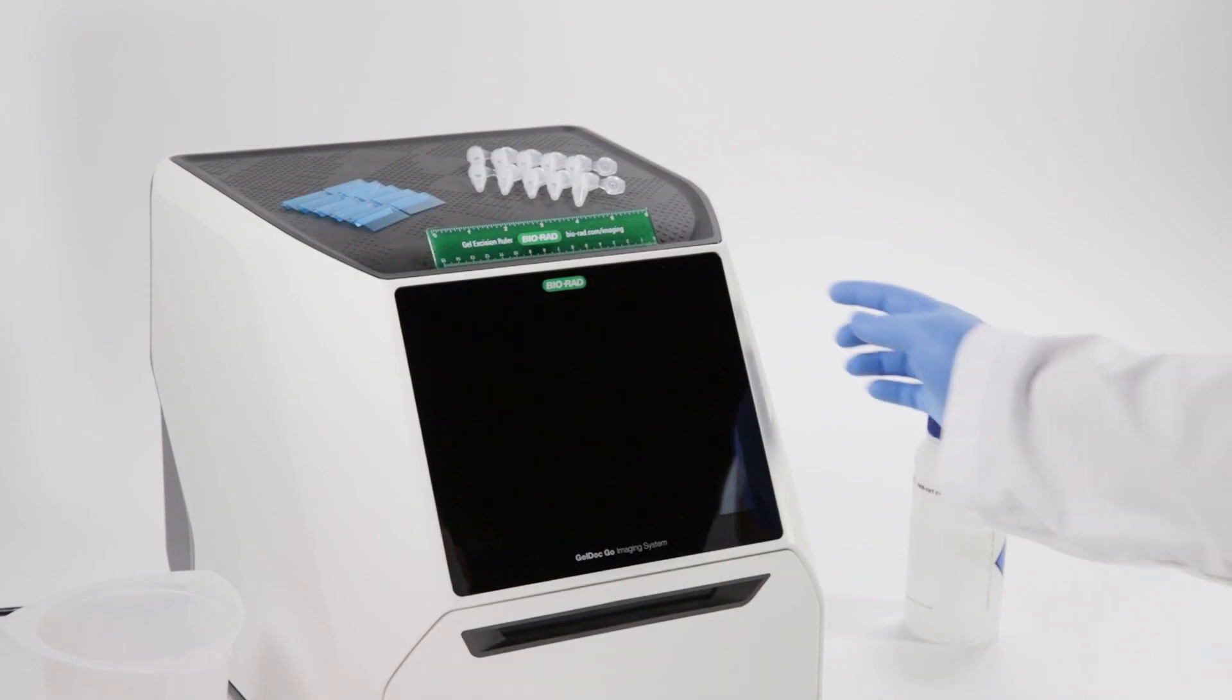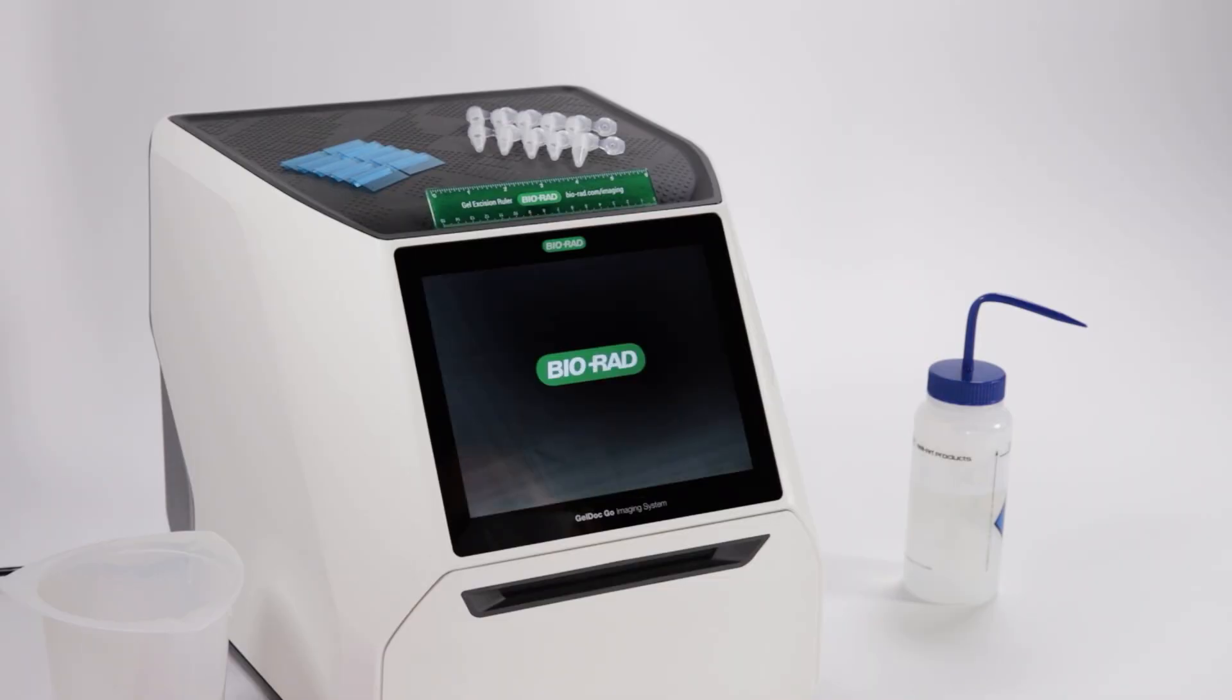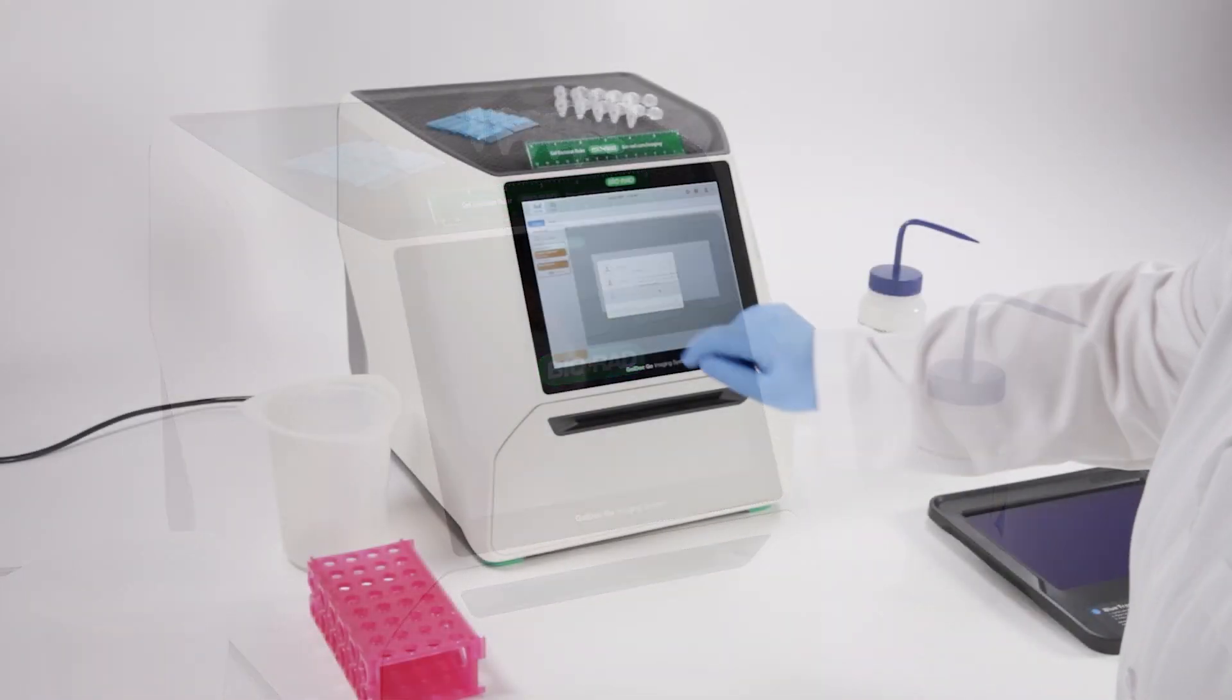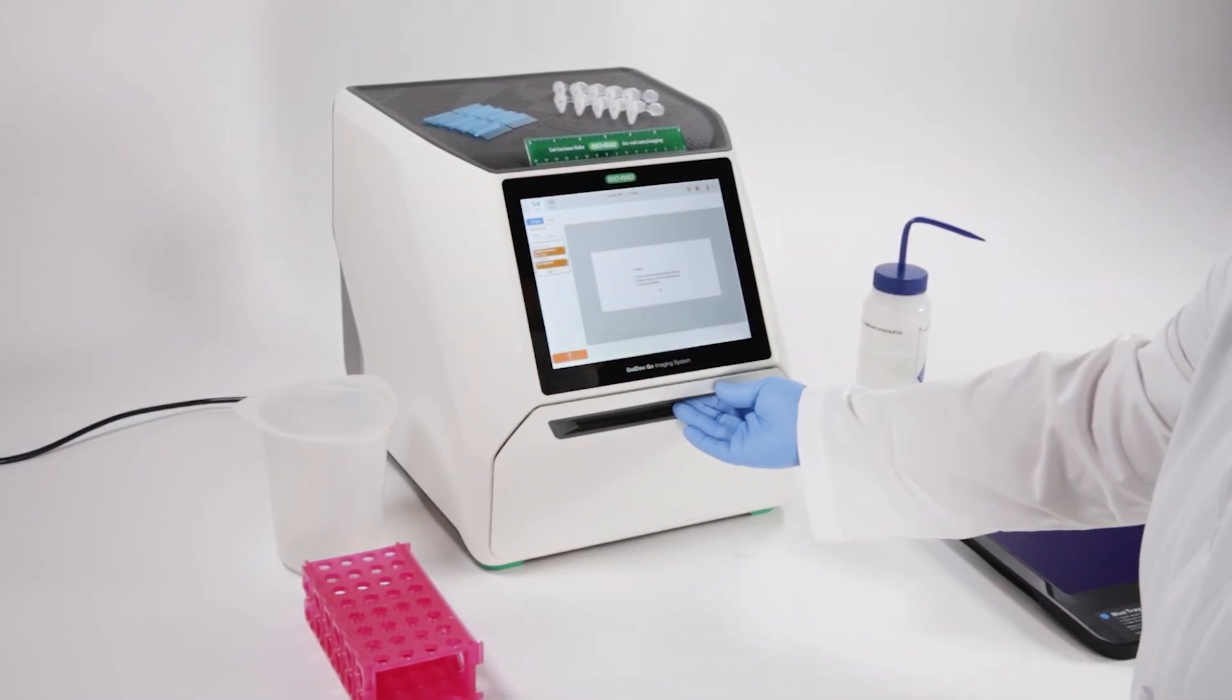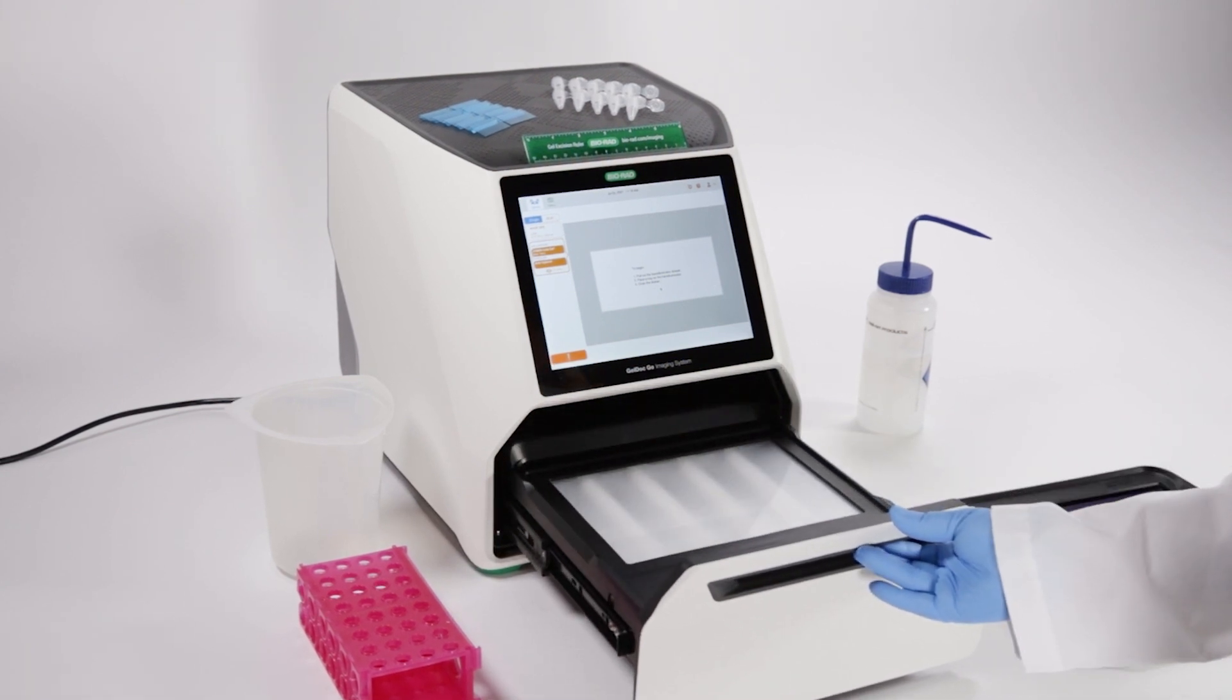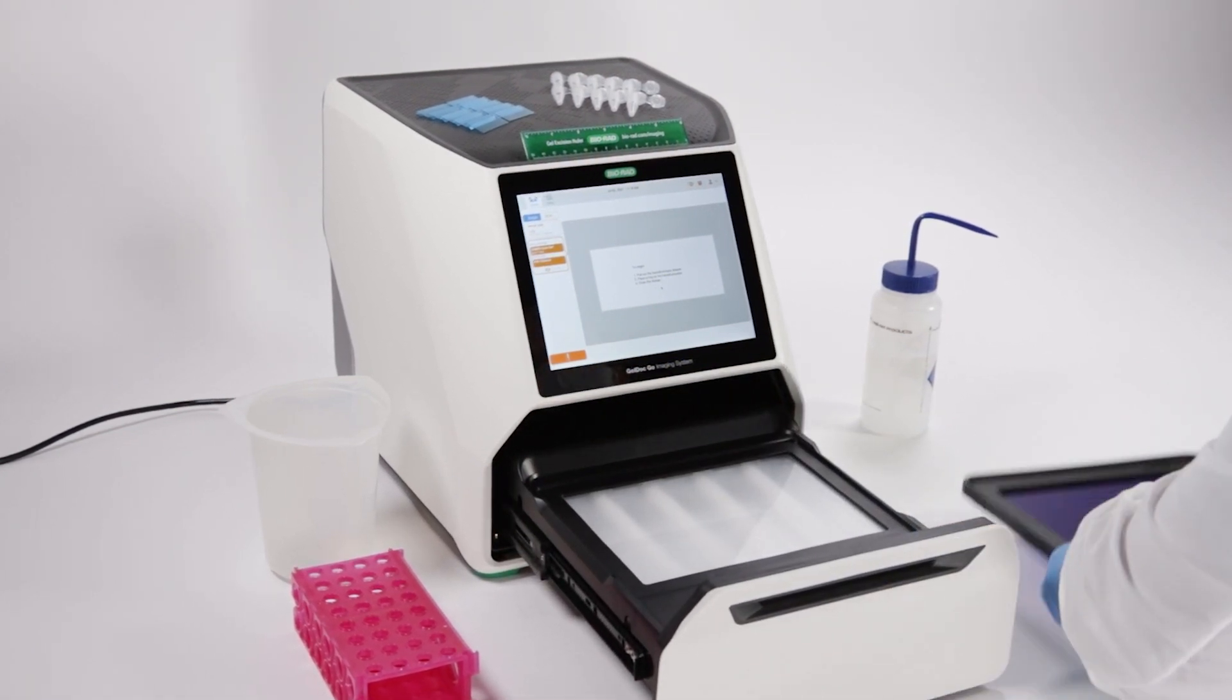To get started, turn on your instrument. Pull out the transilluminator drawer and place the desired tray on the transilluminator.